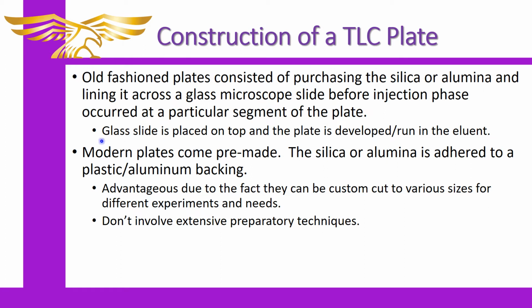I'm not saying it may not still be in use, but I've never seen anybody use this now because we have the pre-made plates and they're not too expensive. They are more expensive than some things, but they're not as bad as the media that you would get for column chromatography work. It's very different.